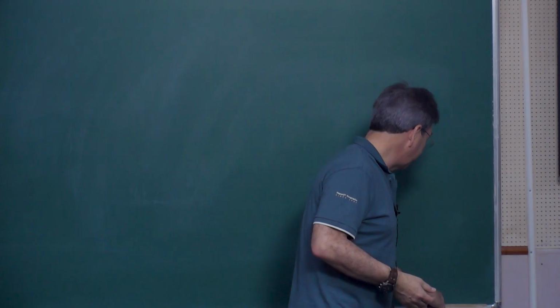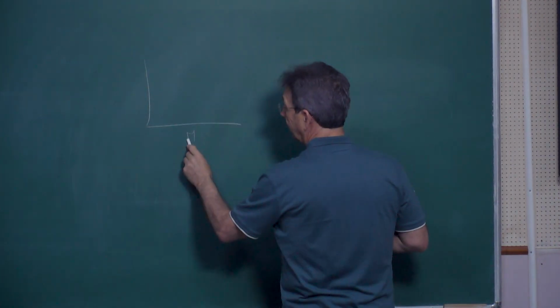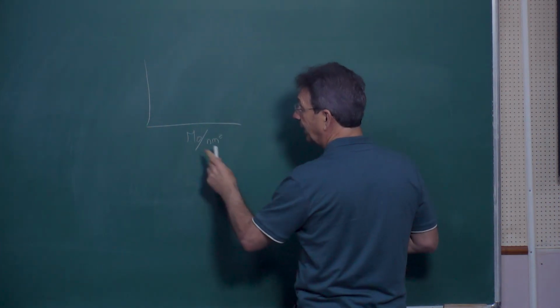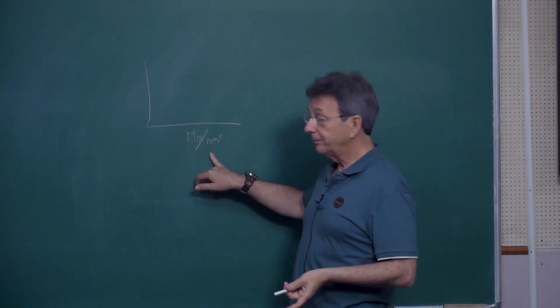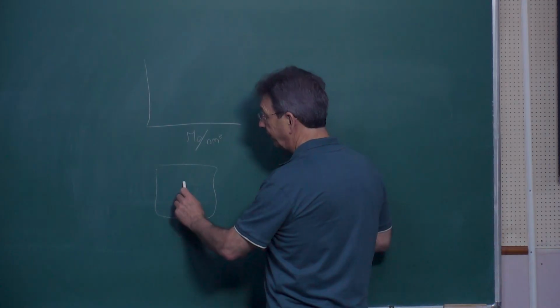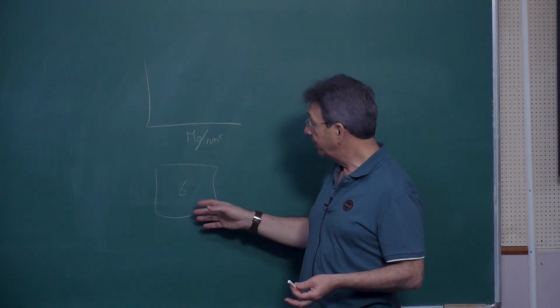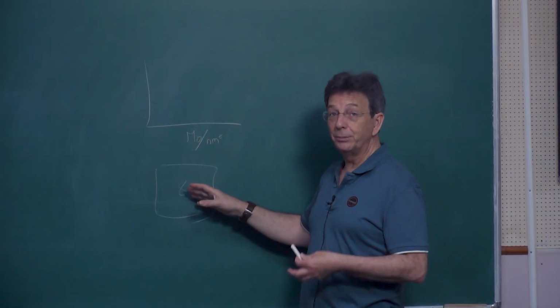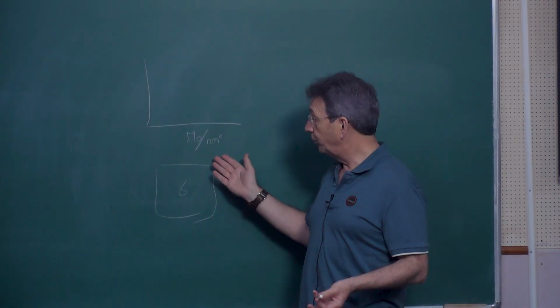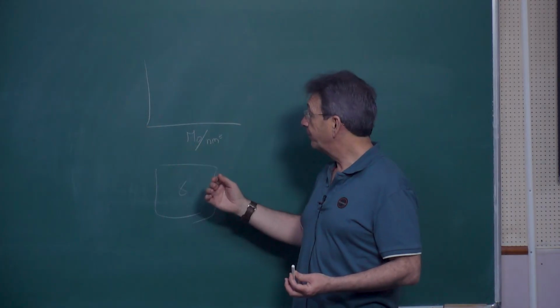Actually, I was looking for that figure that I had in some paper, where basically with the loading, and usually for loading, the unit I use is molybdenum atoms per square nanometer. Typically, because in a square nanometer, you may have up to 6, 7, 8 atoms, depending on whether this is vanadium or whatever. So it's quite easy to remember. It's not 10 to the minus 28 or whatever. It's up to 8 atoms per square nanometer. So you are working on a scale which is similar to the size of these moieties.